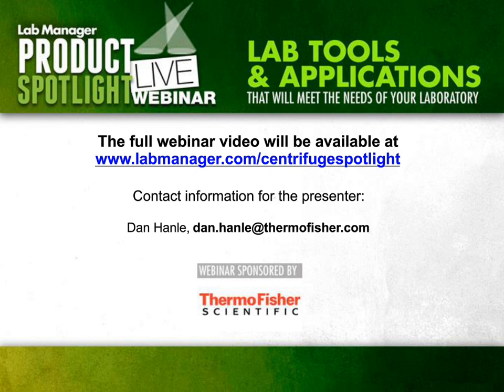So basically a benchtop is going to be pretty robust. You don't have to worry about servicing the motor drives. Years ago we used to have brushes in them. You had to change the brushes. That's long gone. There are some things, like if the door has a spring opening, which many of them do now, gas spring opening. You've got to watch that. If it's being used a lot, it might start to fade.